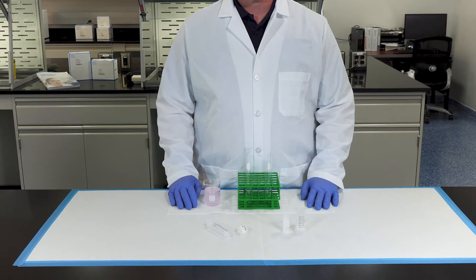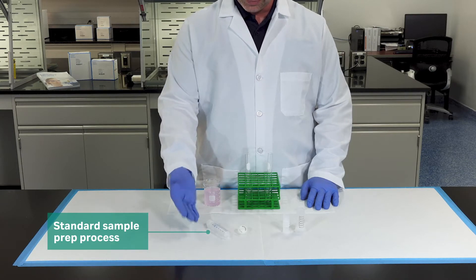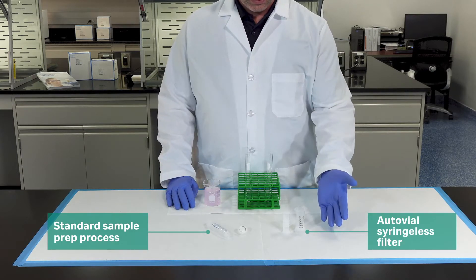Today we will be showing the differences between your standard syringe and syringe filter, and the Whatman AutoVial syringeless filter from Cytiva.